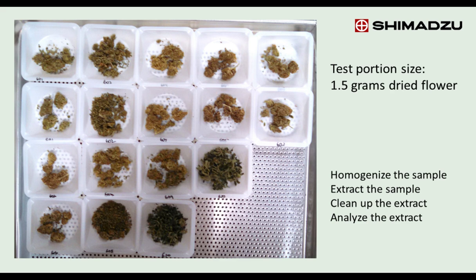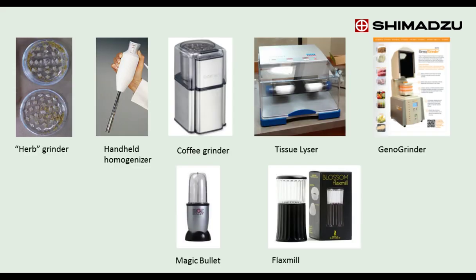If the pesticide was incorporated into the plant matrix and we didn't grind up the sample, then it might happen that the pesticides could be in the product but not detected. So it's important to grind up the sample to release the pesticides from the plant matrix. So for grinding, we investigated several different techniques. And our criteria to get the best result was to find the grinding method which gives us a uniform, homogeneous, and small particle size, while having high throughput and being easy to use.